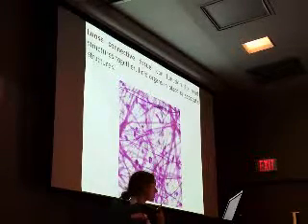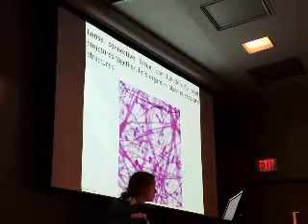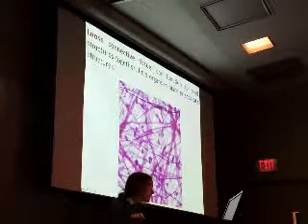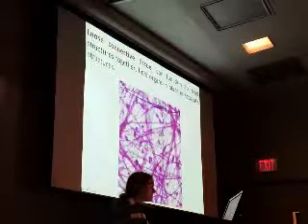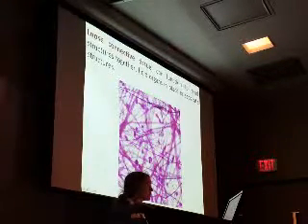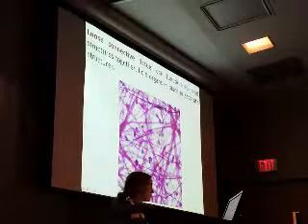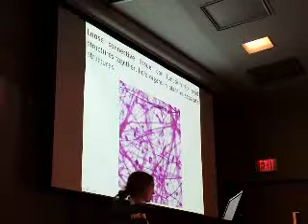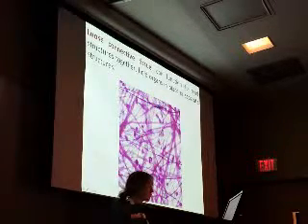And what you see in this image, let's make sure you can identify some of the important features. So you see nuclei that correspond to fibroblasts. You see these thick filaments, and that is collagen, a major abundant structural protein in connective tissue. And then you see these thinner filaments that correspond to elastin. So that's what's there.